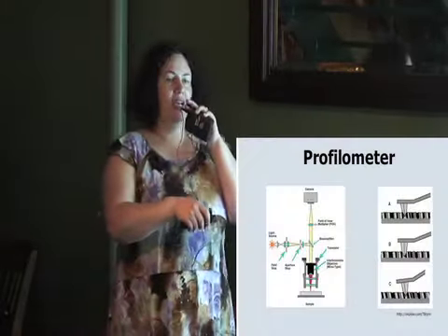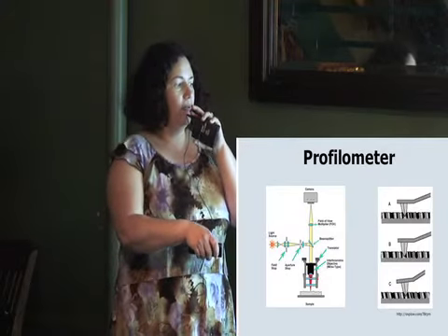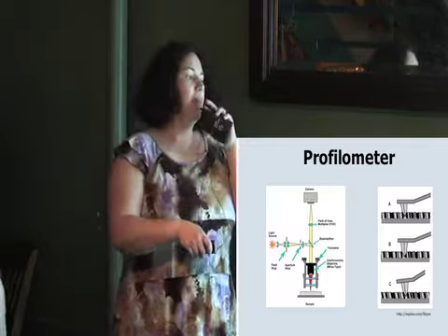Using basically the same principle of the optical microscope, but with a little bit of a twist, we'll talk about the optical profilometer. Another interesting tool that will also have the light source hitting the sample, and from the sample coming back to a detector. But now the profilometer will scan the sample. So we'll create a map of the sample profile. Like if you think about the tips in the old LPs or the laser in the CDs, basically we'll go through the grooves and we'll make a drawing of that surface.